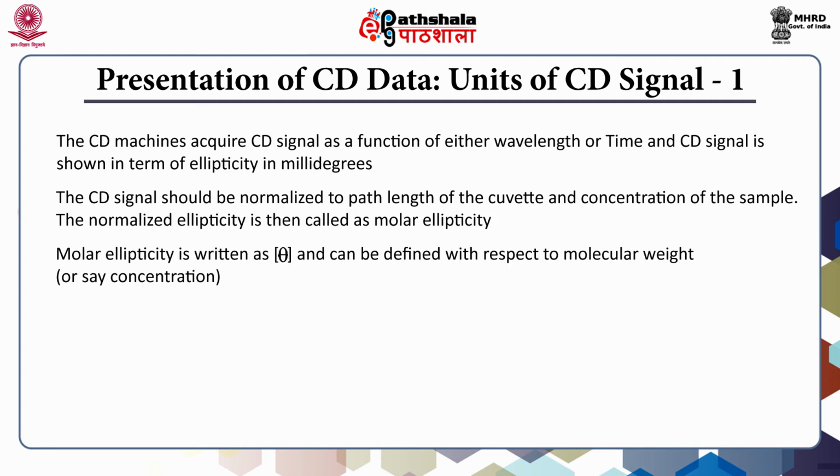Molar ellipticity is written as theta enclosed in brackets and can be defined with respect to molecular weight or concentration. You can see the equation shown in red.